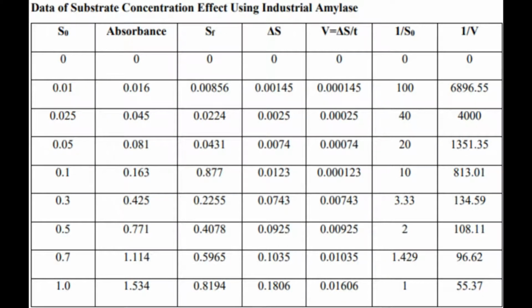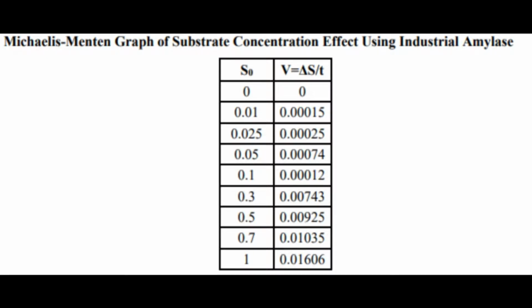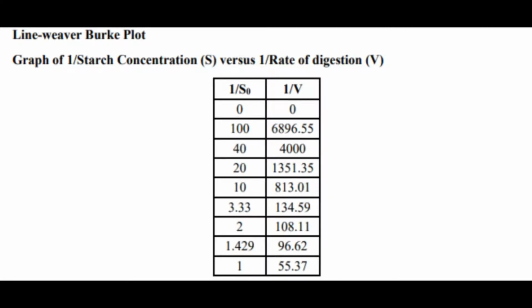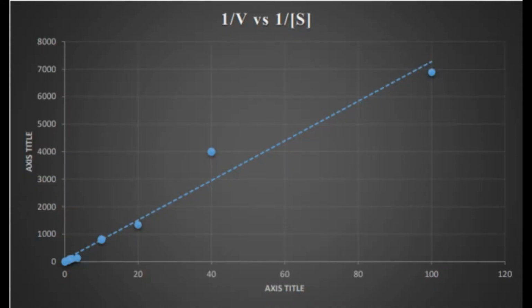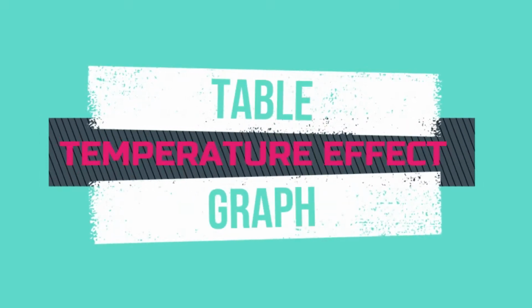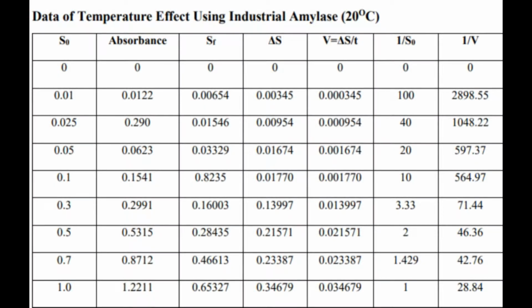This is the result for the concentration effect in the enzyme experiment. This is the result for the temperature effect in the enzyme experiment.